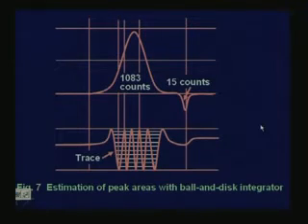Now, gas chromatography, as you know, is extensively used not only for analysis of the gas mixtures coming out of some industrial process, but also, suppose some other company is making a particular mixture of gases, to know what the components of the gases are. It is very difficult to tell. Once you have separated the gas components, obviously you can use several other methods to know what each component is, but the basic separation is the most important thing.